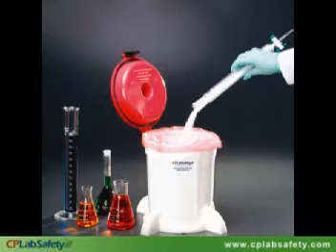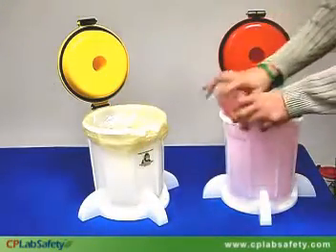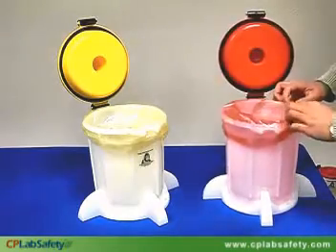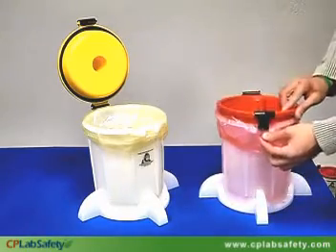Our benchtop solid waste container has the same basic features as EcoFunnel, but is designed to temporarily store solid wastes, such as kim wipes, wet silica gel, radioisotopes, contaminated gloves, wiping rags, and other disposables.